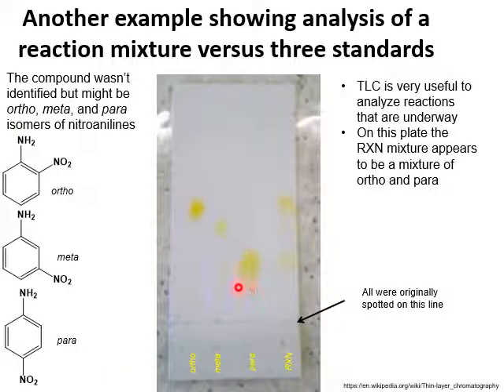How can I judge? Well, because of the strength of the stains. You see, these are much bigger, but they're also quite not well done. So that's something that you might be interested in, and you should ask me about why I'm saying these are not well prepared. So yes, all of these spots were originally created here. So you can see the red dot that I'm pointing at. Usually you spot here, you spot here, and you spot here, and you spot here.